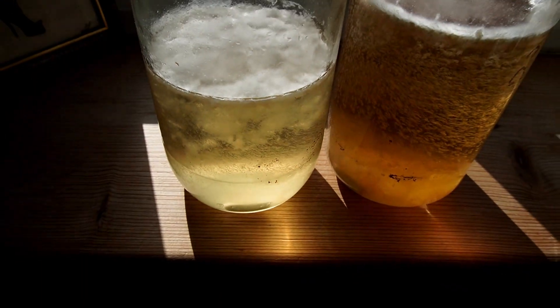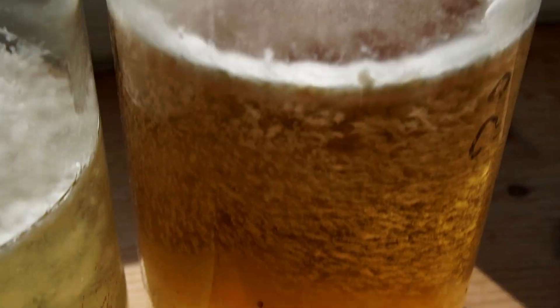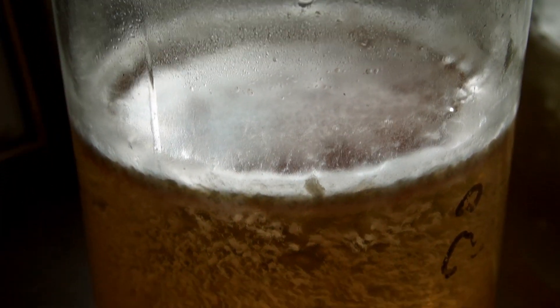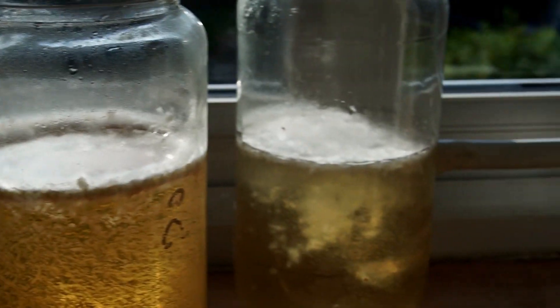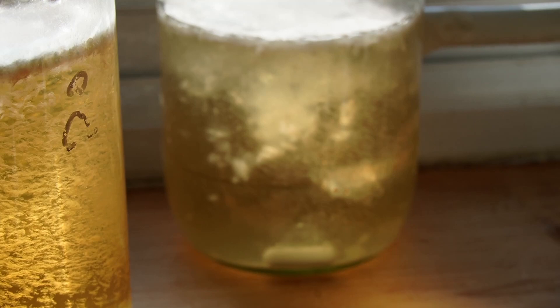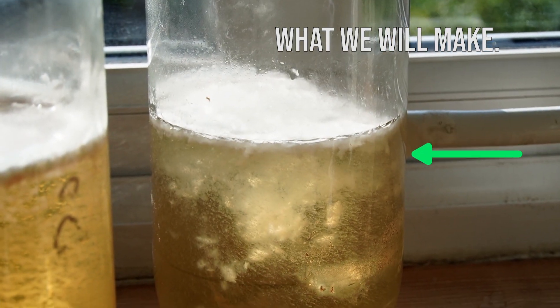I was recently growing some cordyceps and the instructions that came with them said to make a very thick, very nutrient-rich light malt extract liquid culture. While I did trust what the vendor was saying, I still decided to make my own batch with fewer nutrients just to compare it. Instead of covering that in the cordyceps video, I'm going to cover it in a separate video where I can go into more detail.